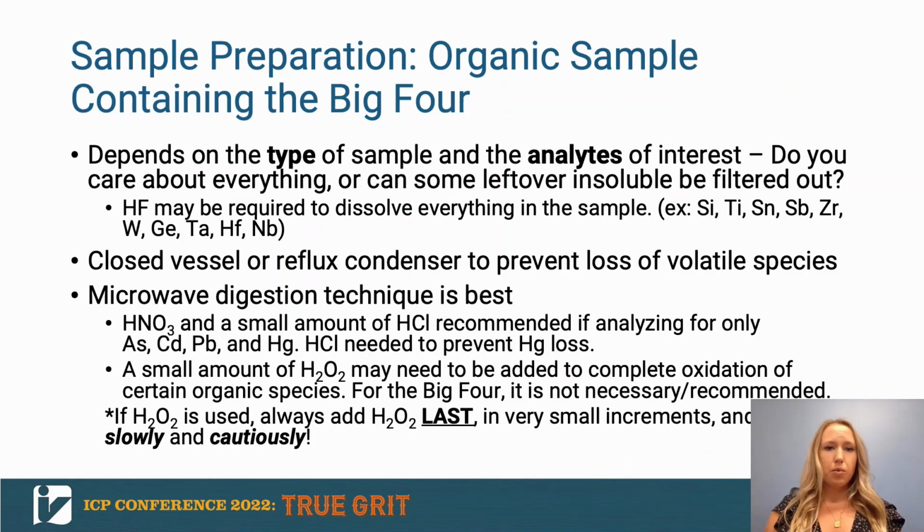When selecting your sample preparation technique, it's important to consider both the type of the sample and which analytes you're interested in quantifying. Some sample types will require hydrofluoric acid to achieve a complete digestion, but HF can also cause stability issues with other elements that may be of interest, such as rare earth elements and some of your alkaline earths. In this case, you will need to determine which elements are important for your analysis and whether the addition of HF is truly necessary to achieve accurate results.